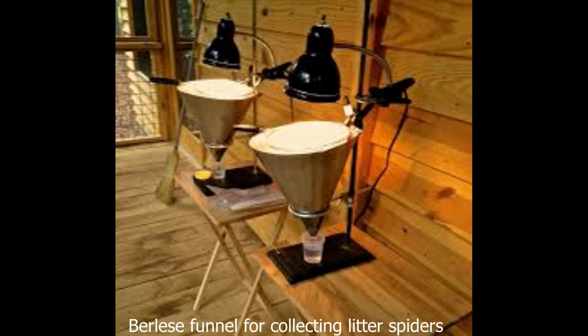The light and the heat from the lamp make the spiders and insects slowly move to the lower part of the funnel and finally fall into the preservative like alcohol kept inside the beaker. The preservative will kill the spider or other insects and also preserve the spiders and insects from decaying. By this method, we can easily collect smaller spiders living among dried leaves.